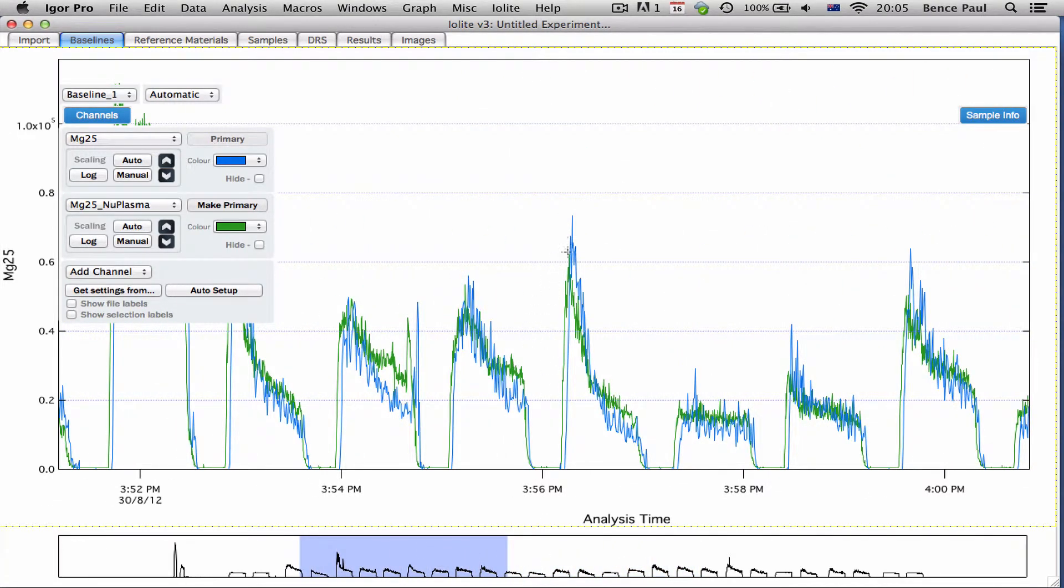Like for example here you can see this very sharp signal decrease is present in both mass spectrometers.